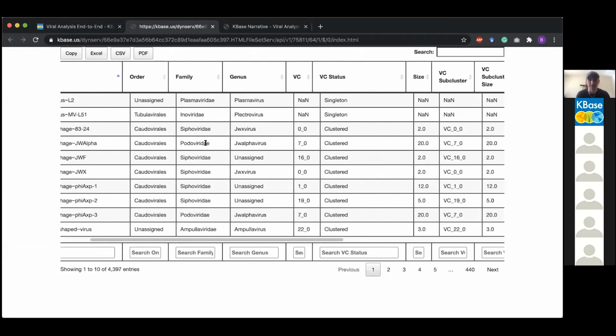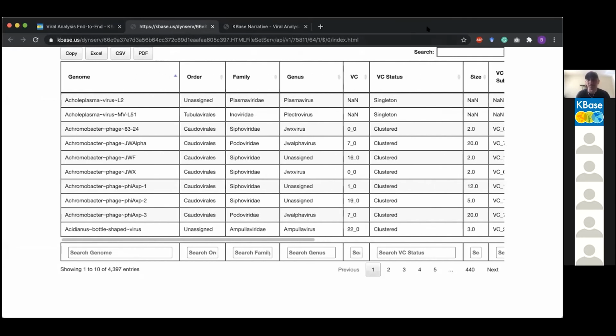And if you don't like to deal with HTML-based tables, you can choose to copy this table to another place. You can download it as an Excel table. For those people who like Excel, that might be the first thing that you do. You can totally do what I'm doing in terms of adding some equations and filters onto your Excel tables. You can download it as a CSV.